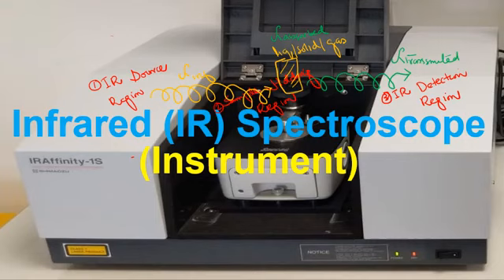So now, dear student, let us discuss step by step the essential parts in the infrared spectroscope and how we can analyze a sample in infrared spectroscopy.